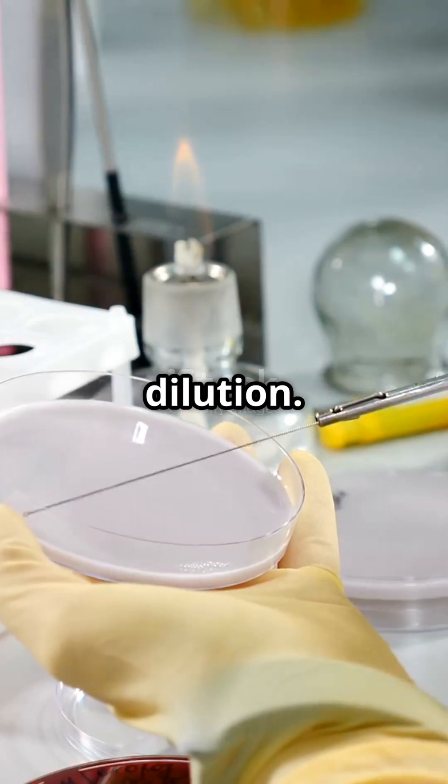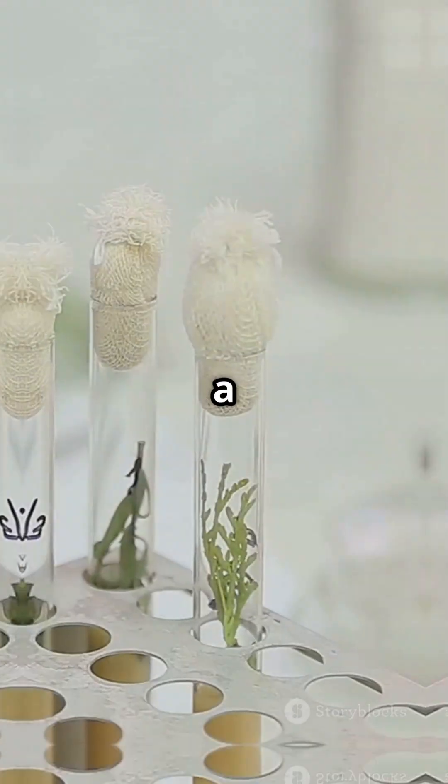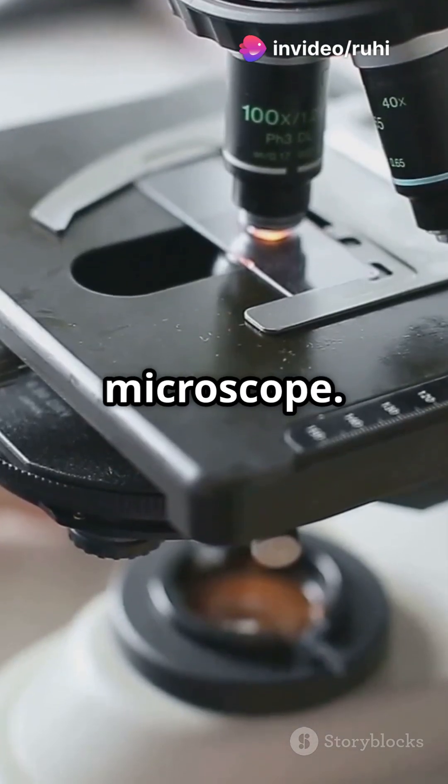Now we're doing serial dilution. In simple terms, we're mixing soil and water to spread out the bacteria. This helps us get a clearer picture under the microscope.